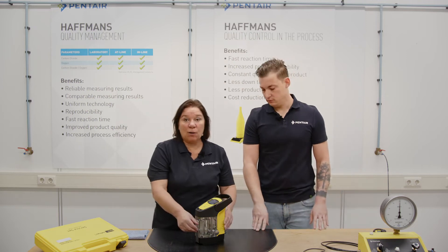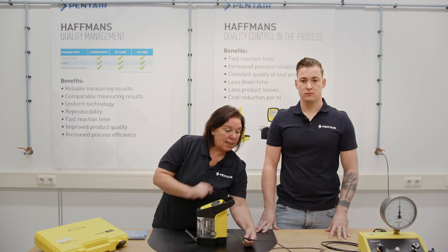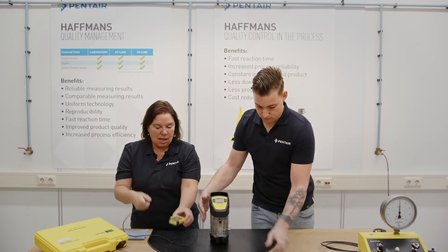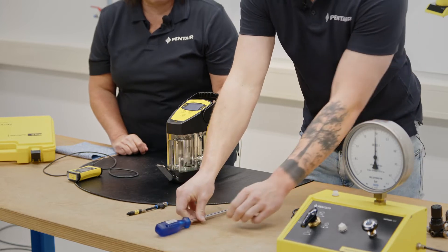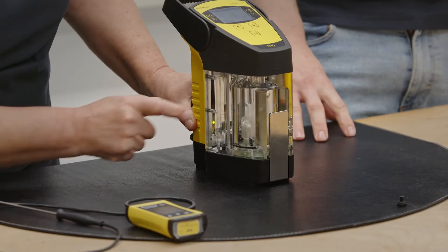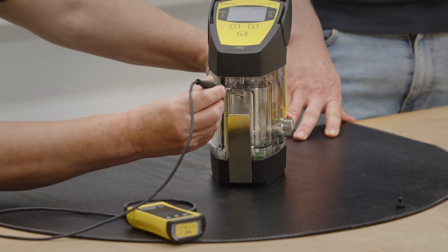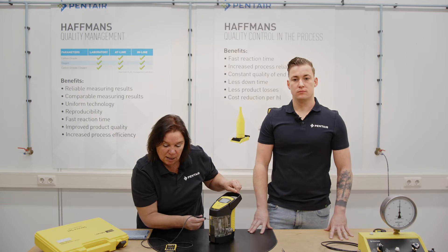For the temperature check, you can run water through the meter via the inlet and measure with your thermometer on the outlet, and check that the value you read from the meter matches the value of your reference meter. The digital thermometer has a thin diameter and we can use the opening for the pressure calibration — take off the black PVC screw. When the meter is filled with water, the tip of the temperature probe of the meter touches the water, and we try to put in the thin thermometer near the tip of the temperature probe. We watch if the temperature of the meter matches the value we read on our certified digital thermometer.